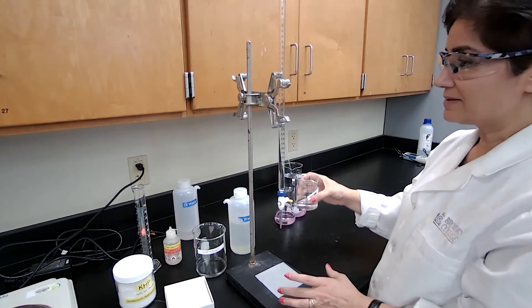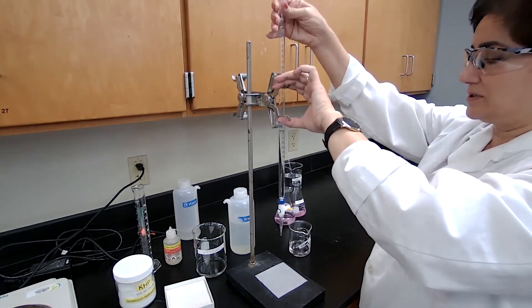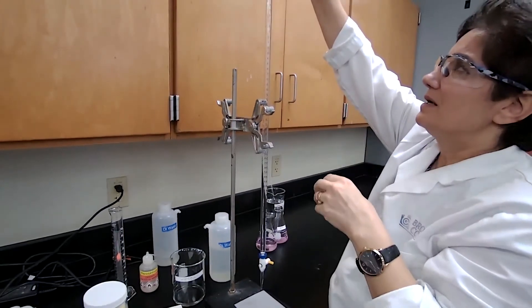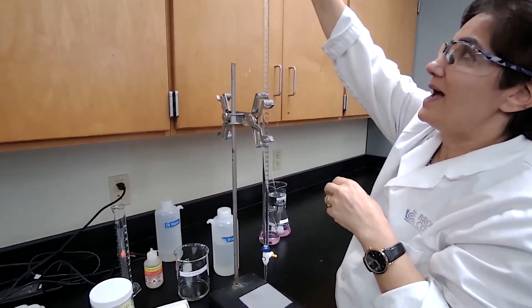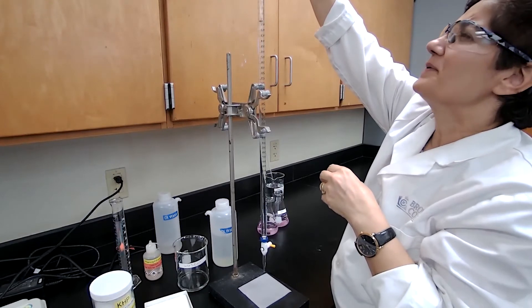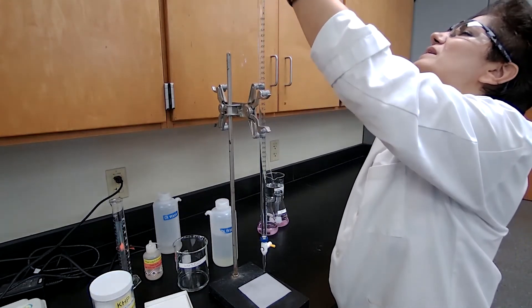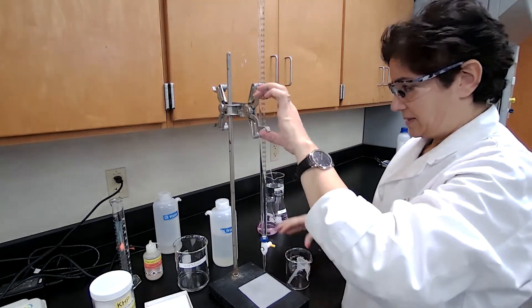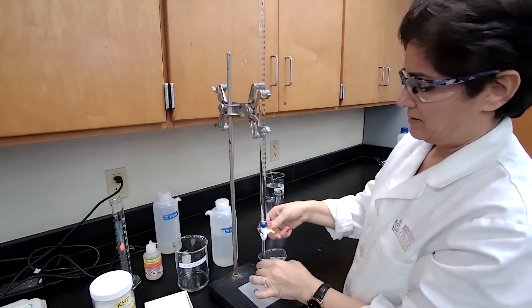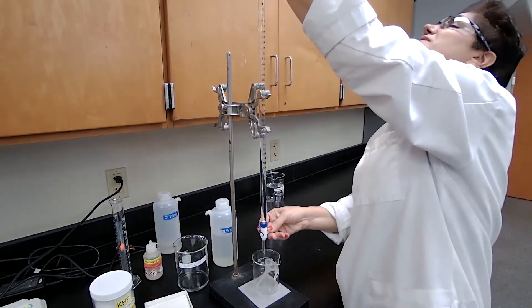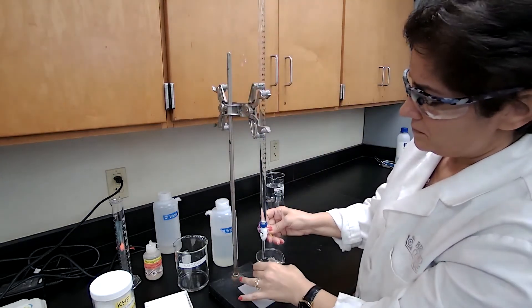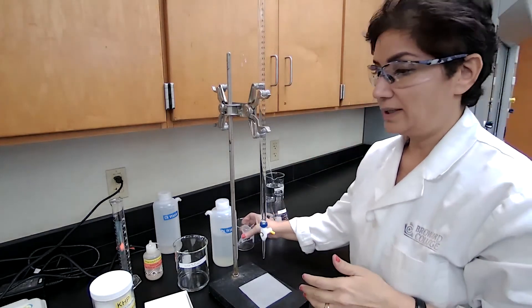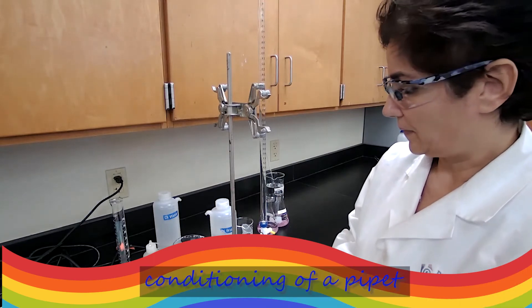Now I can refill the burette with sodium hydroxide, go to zero line, and use it for the next part of the experiment, which is a titration of the weak acid, which we have as acetic acid. So I'm going to take it to zero, adjust the volume at zero, exactly at the 0.00 line.